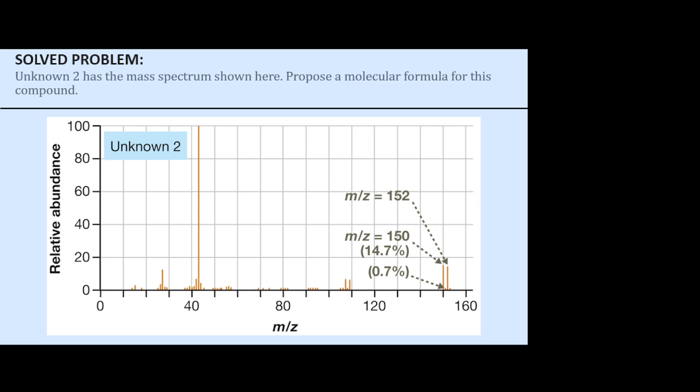If you have multiple bromides, it would actually have the exact same rules. Remember the formula I gave you for the isotopic ratio? You can do that same isotopic ratio for anything. If you think it's a chloride, you could plug them in and see if that would give you something like 2 chlorides. What would happen is the bromides don't change much. They're almost 50-50, right? So adding more is like 52 instead of 51.